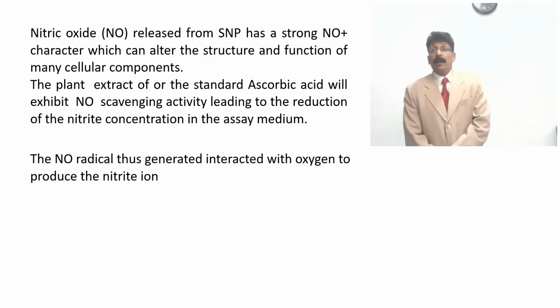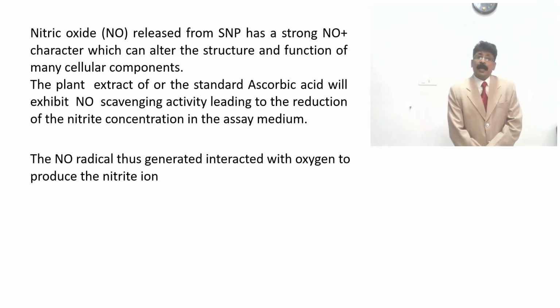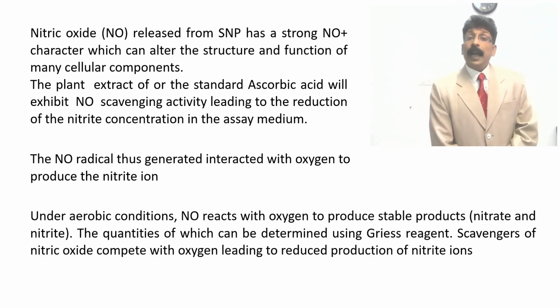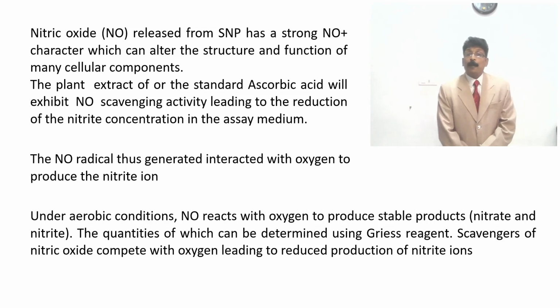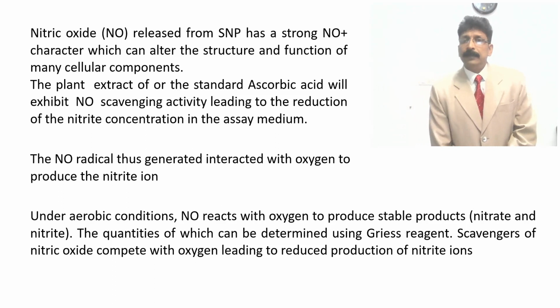Then the nitric oxide radical thus generated reacts with oxygen to produce nitrite ion. Under aerobic condition, NO reacts with oxygen to produce stable products, nitrate.